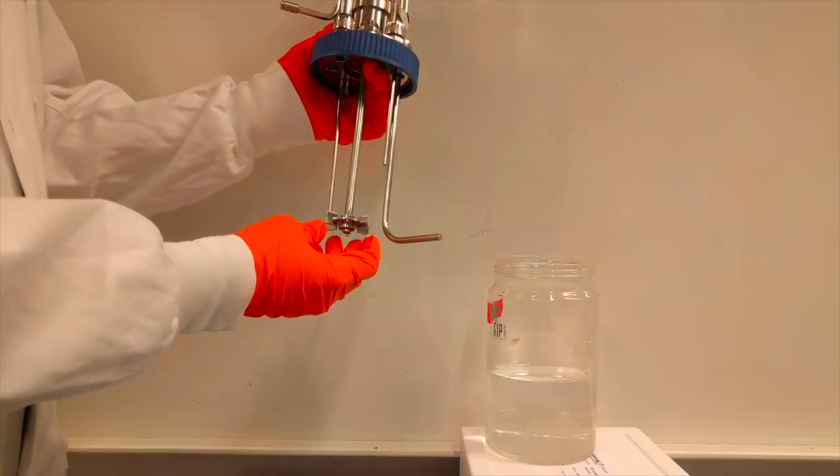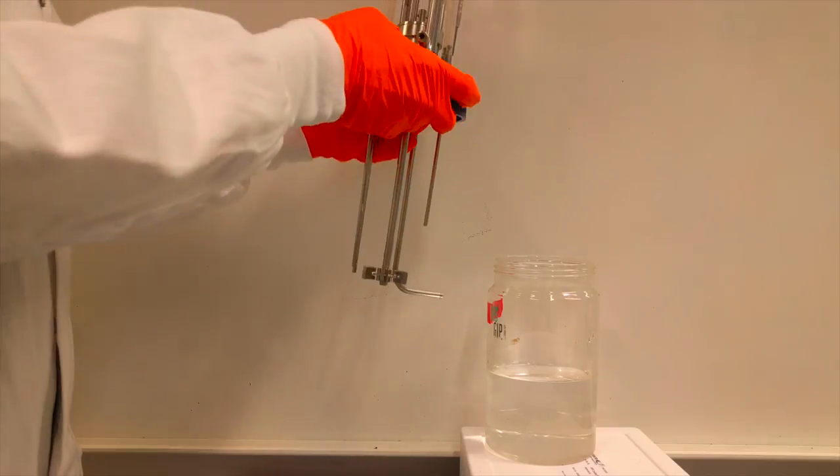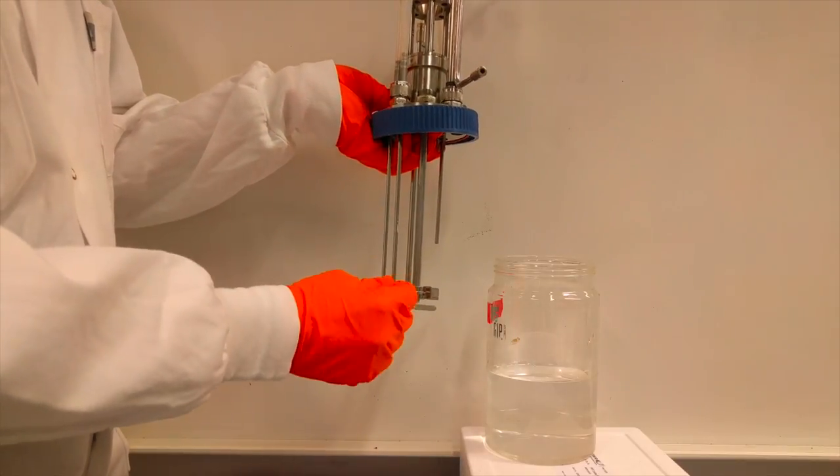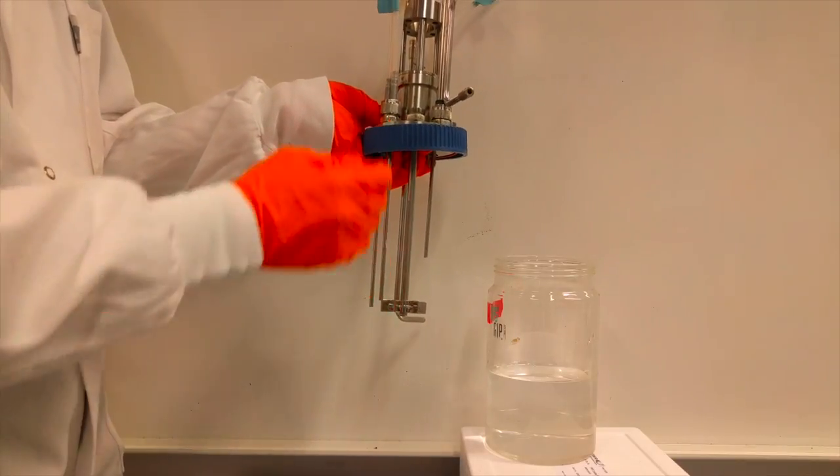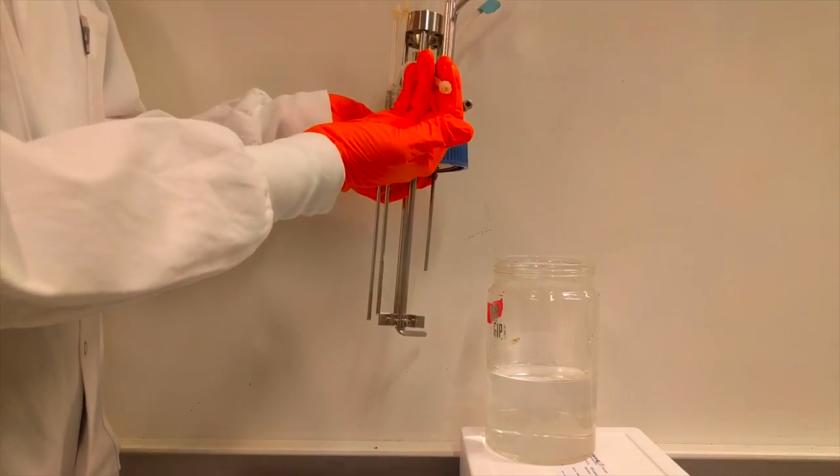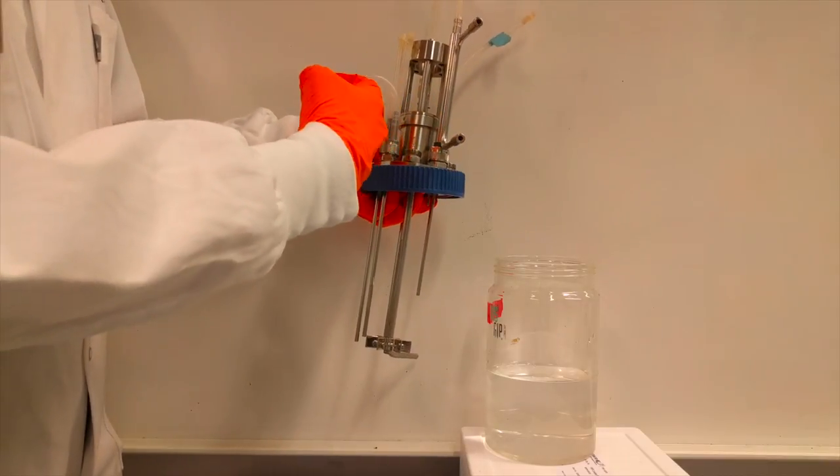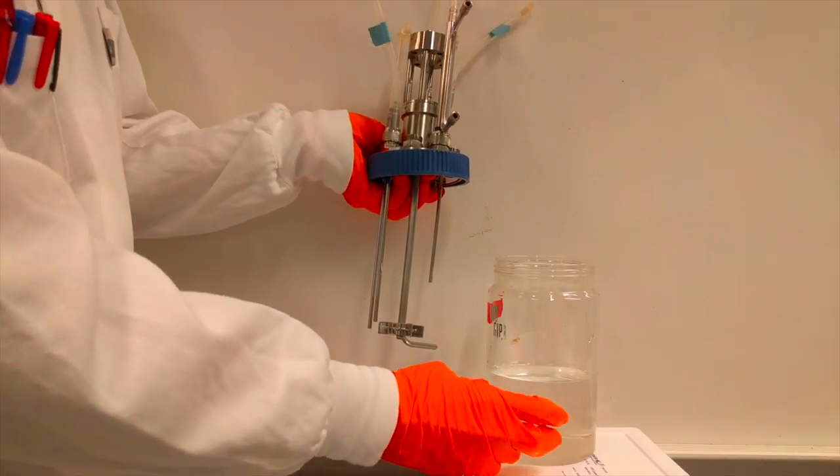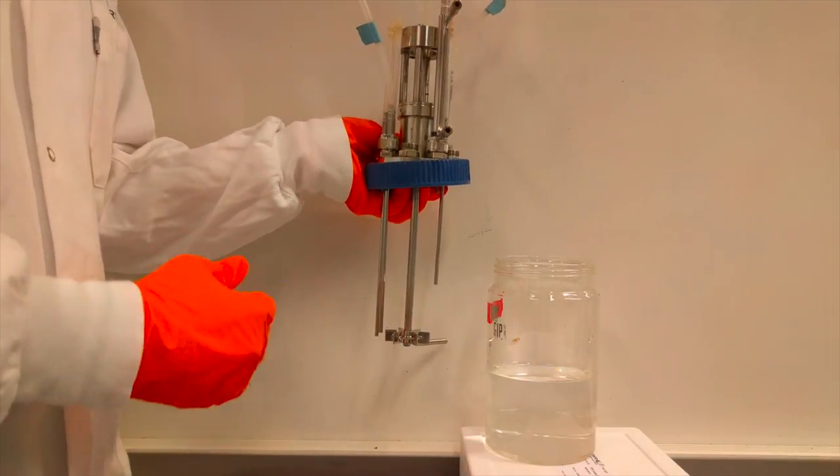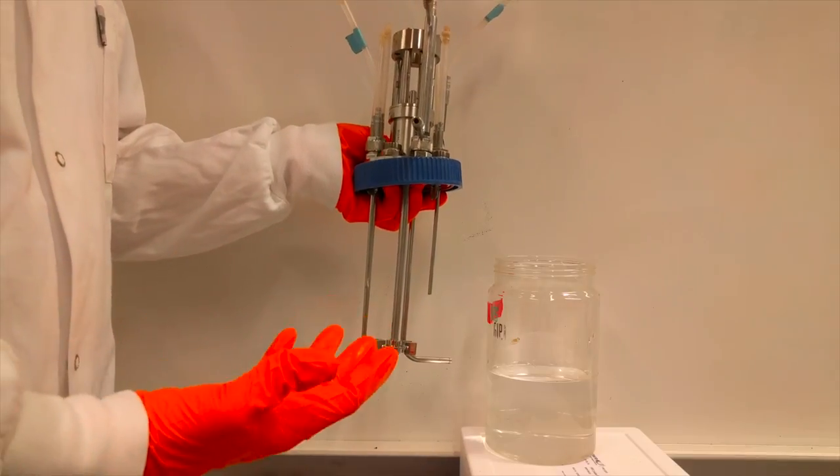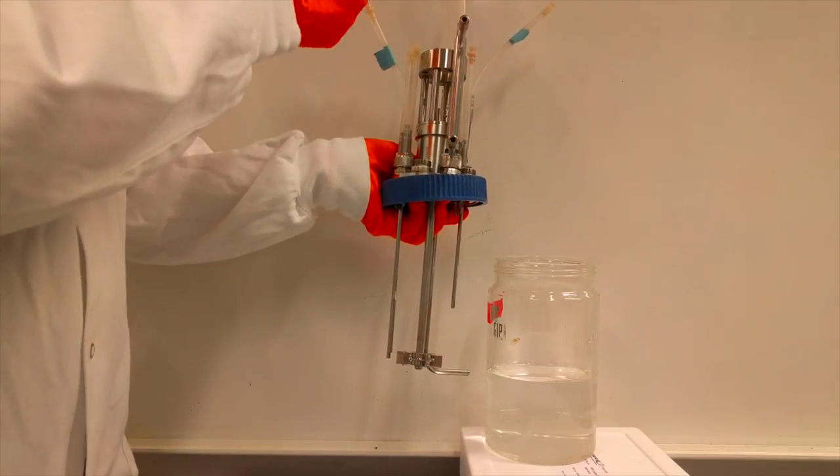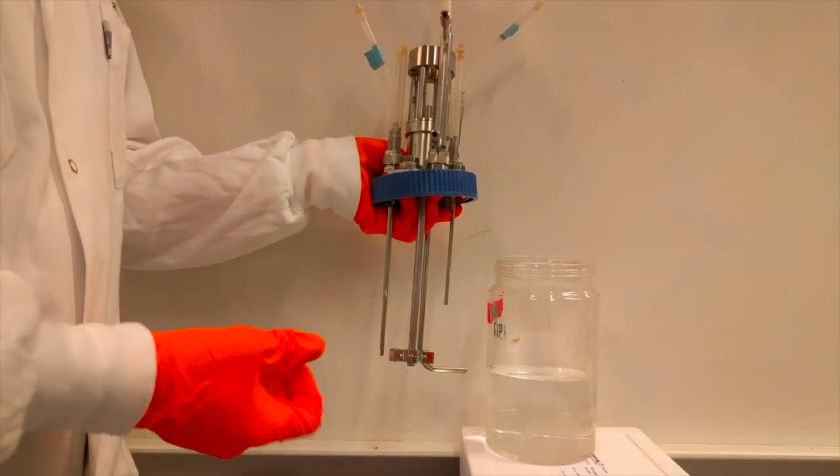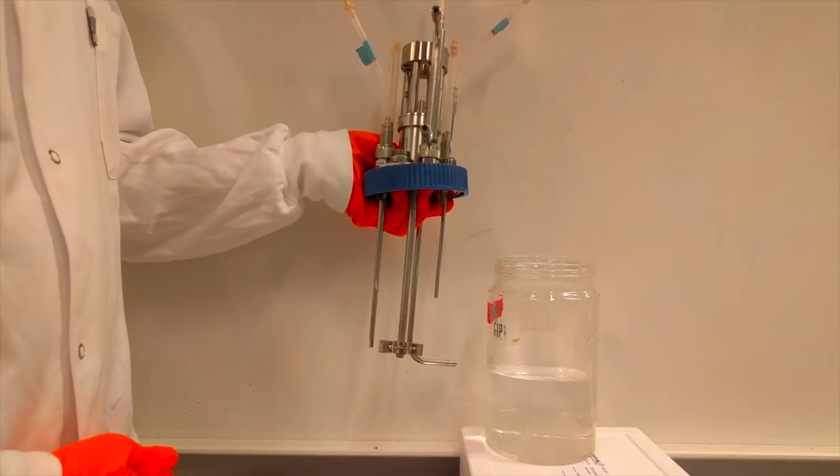The next thing to take a look at is the sampling port. If we want to be able to take samples while this reaction is going on, we need one port to be below the surface of the liquid. What we can do is actually pop a syringe on here and use the negative pressure from a syringe to pull some of the media out of our solution. We're going to want to track what's happening in our reaction at the level of our cells.